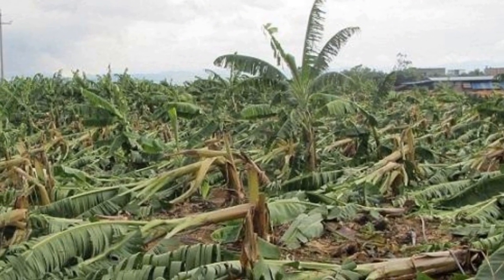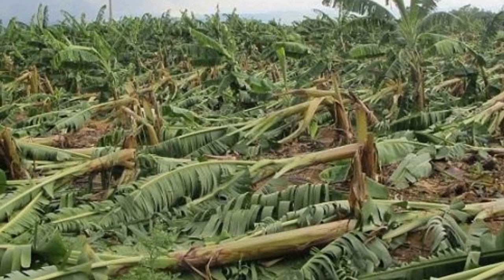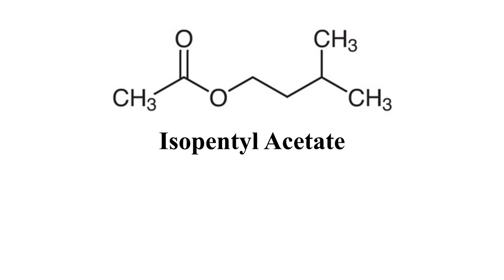Recently, the Caribbean has been ravaged by hurricanes, destroying acres of banana tree farms that are owned by the Cavendish Distilling Company. Yes, the same one that makes the famous banana liquor. You have been assigned the task of synthesizing synthetic banana oil, something that they could use to replace the lost bananas in their drink. As you know, esters are commonly used as flavorings in a variety of foods.